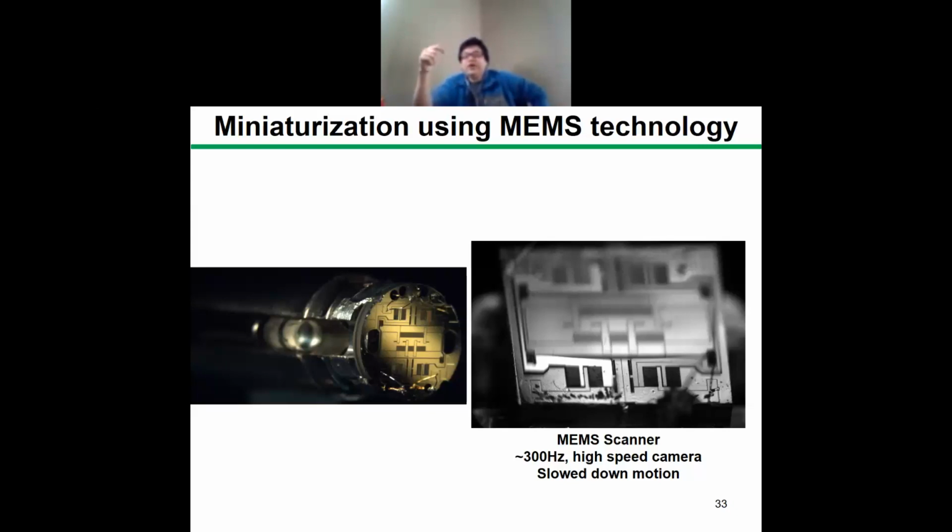Also, this kind of architecture is not limited to confocal and can be used for multiple other technologies. For example, the fiber bundle itself is a perfect attenuation system for different wavelengths. If you go to infrared, the fiber bundle doesn't work anymore. But our system is essentially achromatic. To deliver the infrared, you just need to change the fiber a little bit, to a single mode fiber.